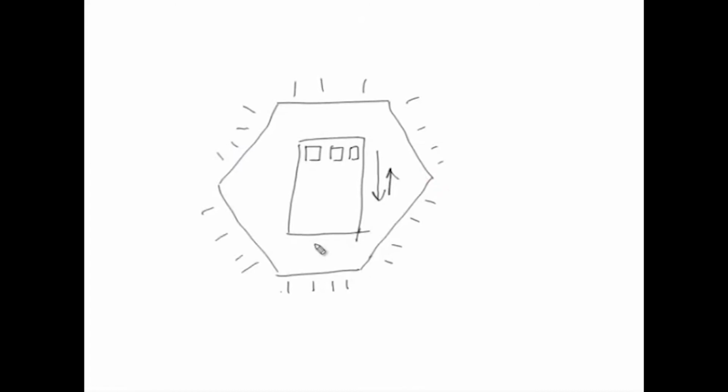Now, these are platinum wires, like I said. Remember, in field inversion gel electrophoresis, what you want is that the molecules should move in the forward direction. So, always the time and the amount of electric field in the forward direction will be higher than in the reverse direction, so that the resultant movement is forward.